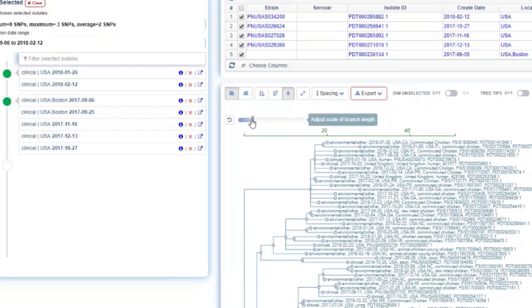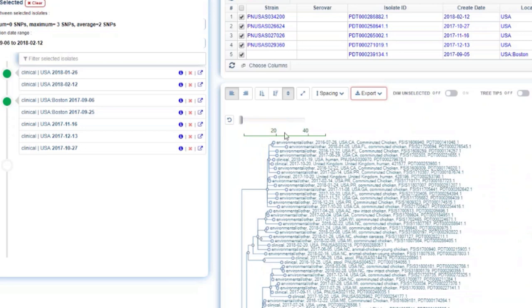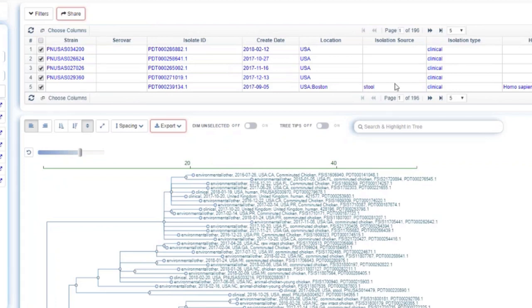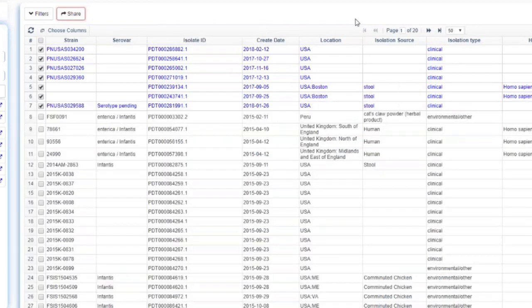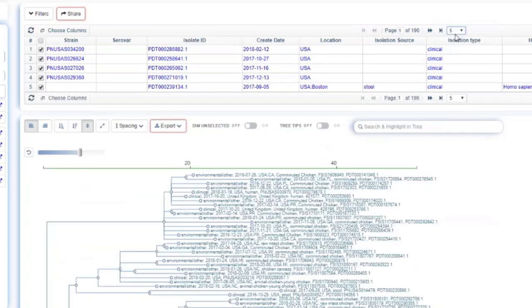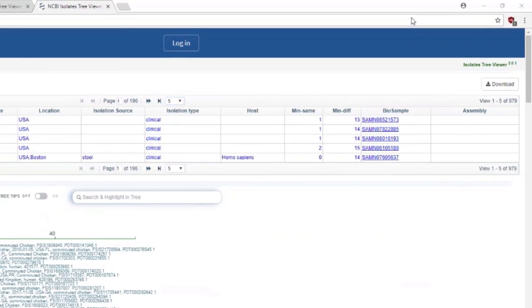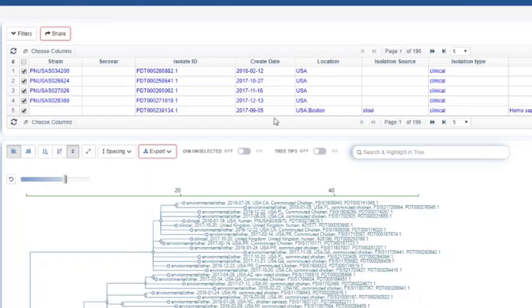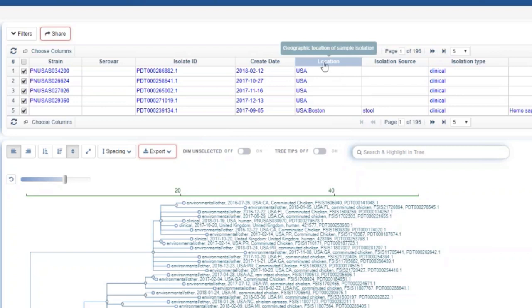You can hit the information button on an isolate to get additional metadata. You can turn off the hover tooltip if you find it annoying. You can control the spacing of the tree for better visibility and collapse or expand it. You can also expand and contract the tree branches to adjust the SNP distances display. The selections allow you to control what's selected in the table view. There's a download button that dumps a TSV file of only the selected rows, and you can choose which columns go into that table.